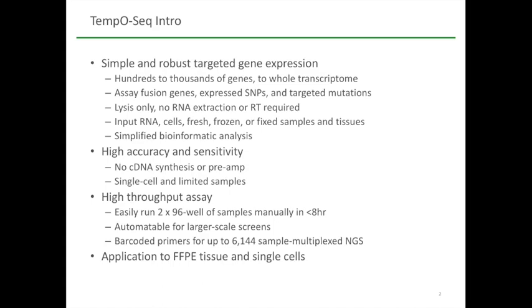In addition, I'll show you that the bioinformatic analysis is simplified. This is because the targeted probes in the assay do most of this work for you and simplify the analysis downstream.